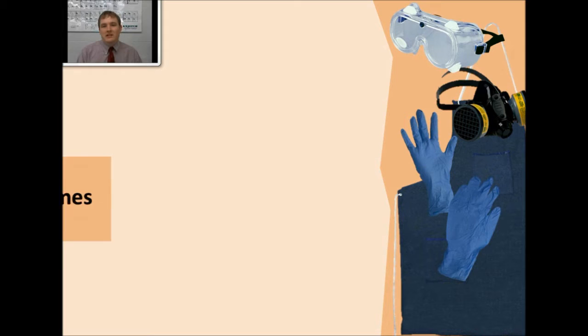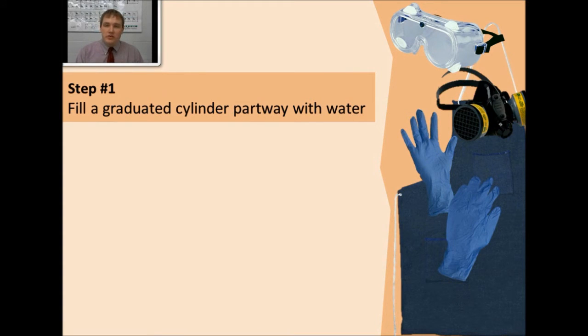The steps are going to be quite different from measuring a liquid directly, but they start off the same. First, you're going to fill the graduated cylinder partway with a liquid. We're just going to use water because it's cheap and easy to use. You need to make sure there's enough in the cylinder so that when you submerge an object, it's going to go all the way underneath the water. But you also want to make sure that there's not so much that when you submerge an object, it's going to push the water level up past the scale. Usually a good rule of thumb is to fill your device halfway with water. I would fill this cylinder up to the 25 milliliter mark because it goes up to 50 milliliters.